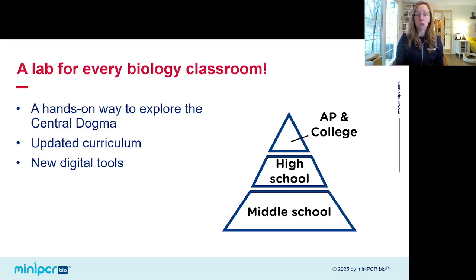We've also added new digital tools intended for use with this lab that give you a bit more bang for your buck. They give you more flexibility around how you implement this lab, and they also support greater student engagement. So if this is a lab that's already familiar to you, you should learn about some new curriculum today and new tools that you can use to make this lab even more customized to your group.